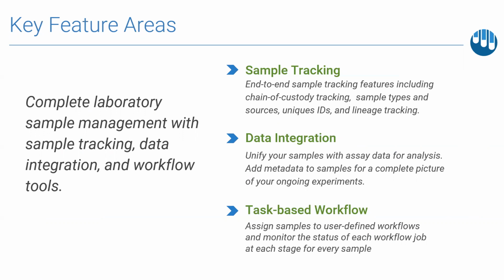But secondly, we have data integration, allowing users to fully integrate numerous experimental assay data sets, as well as metadata at the sample level. And thirdly, we have a task-based workflow feature, which helps users and laboratory leaders to track operational laboratory tasks. So really everyone across the laboratory can take advantage of LabKey Sample Manager. We'll be covering the data integration and workflow features in greater detail in other subsequent webinars, so do look out for more details on them in due course. But for today, we're going to be focusing primarily on the sample tracking capabilities.